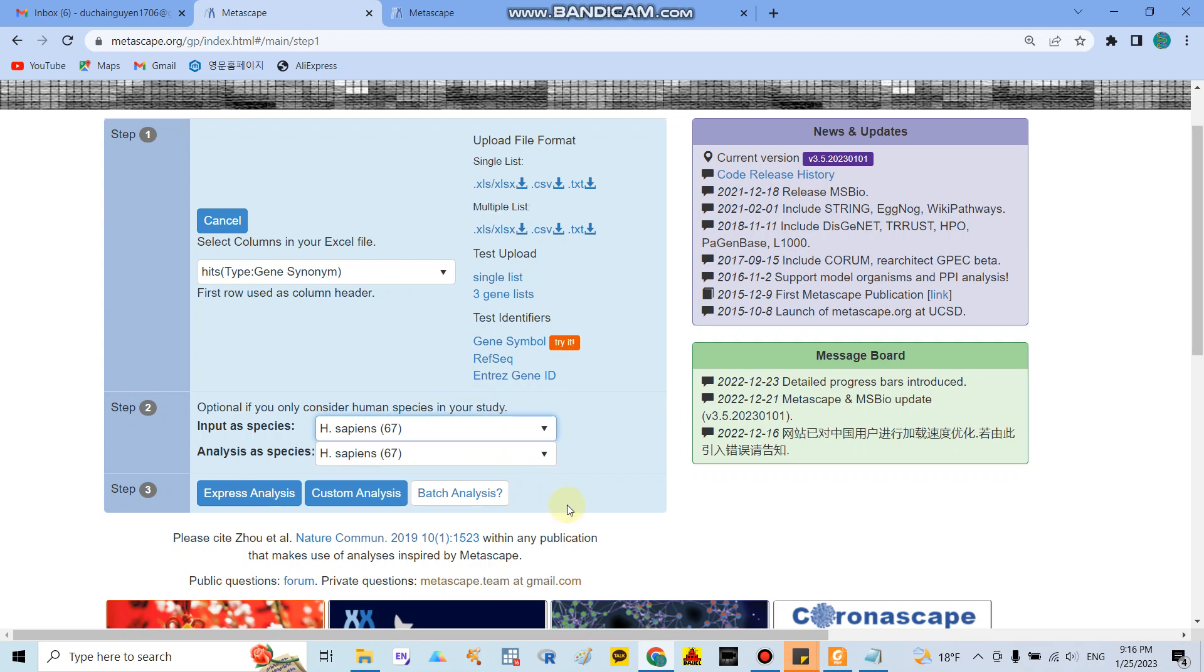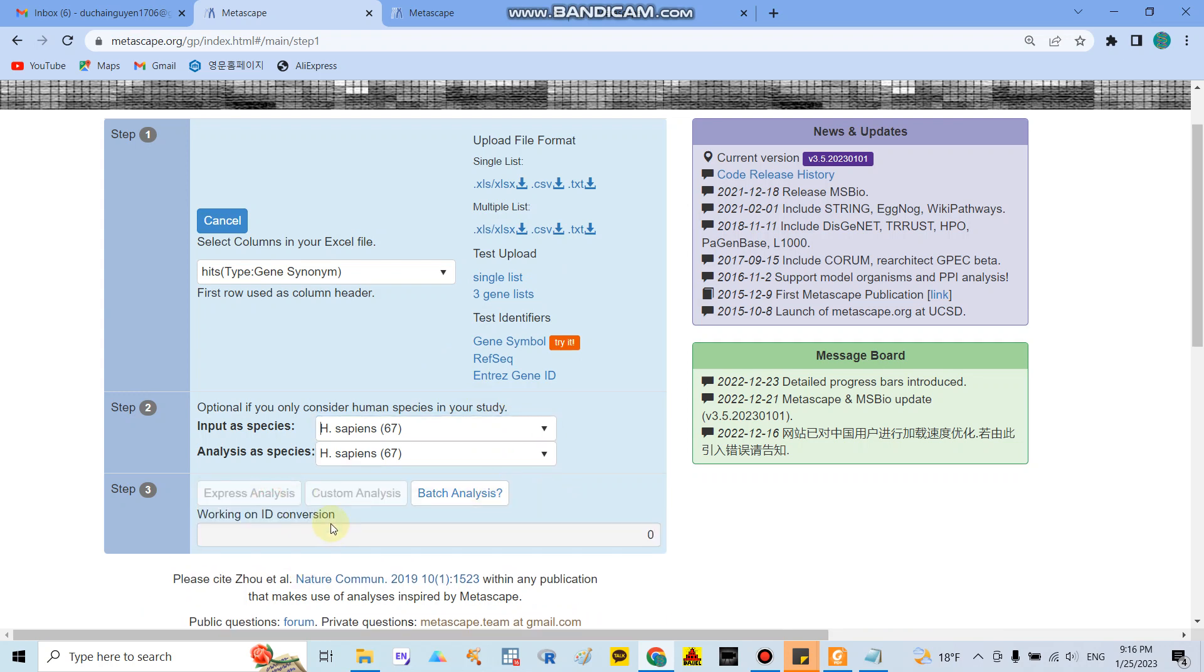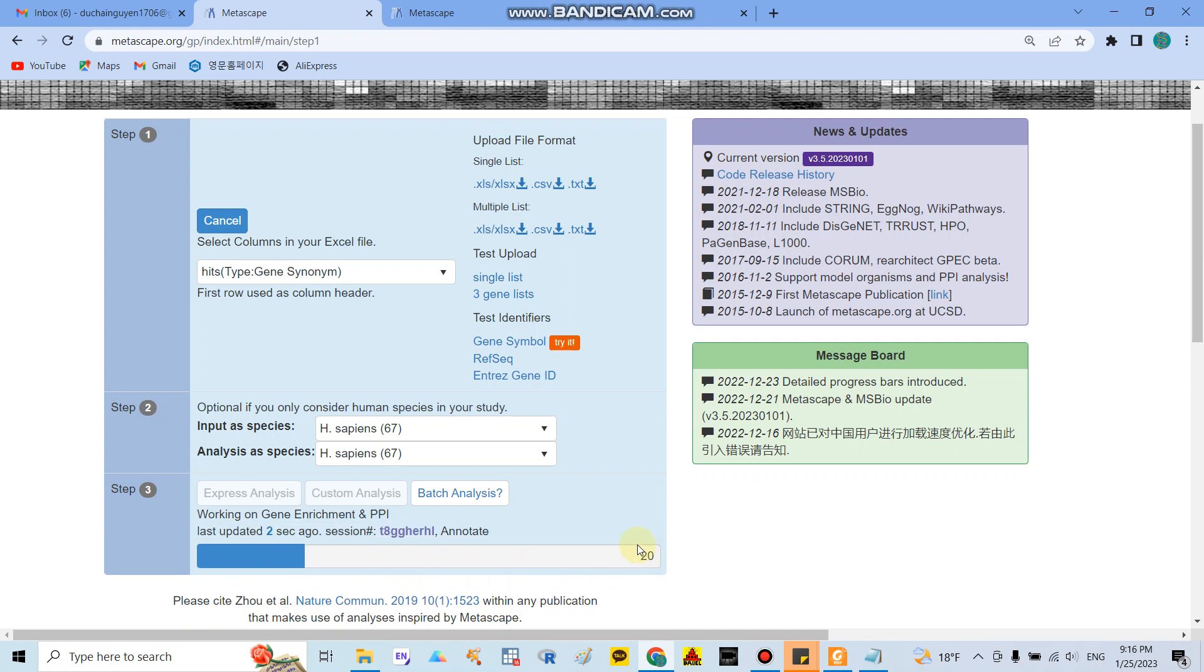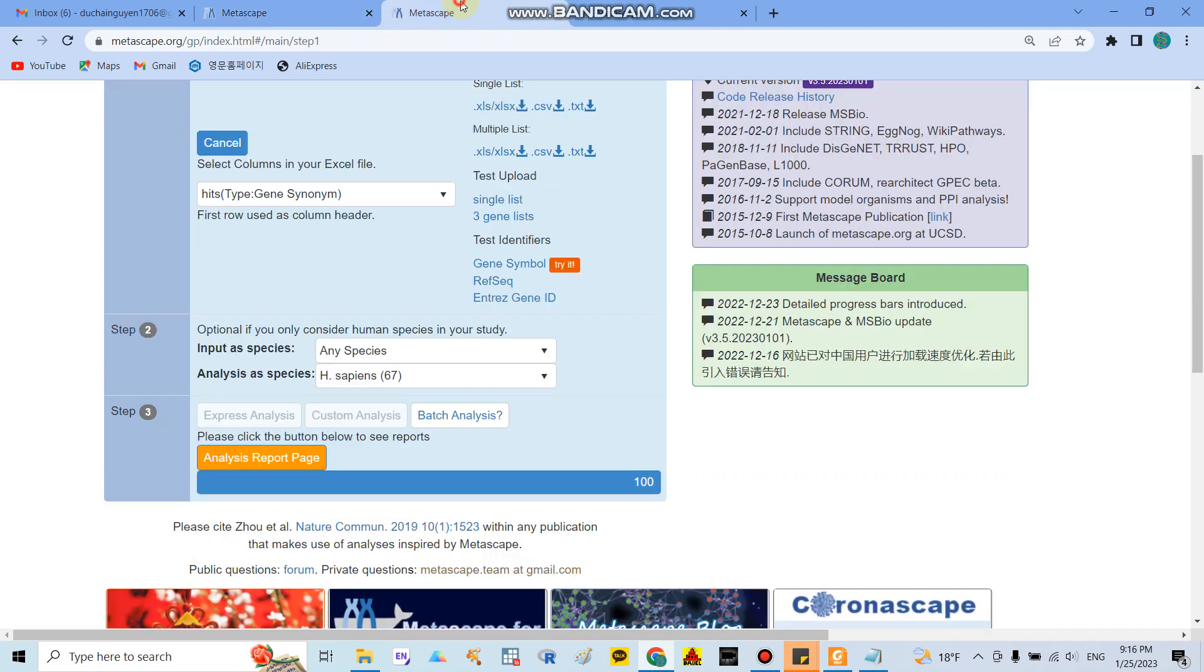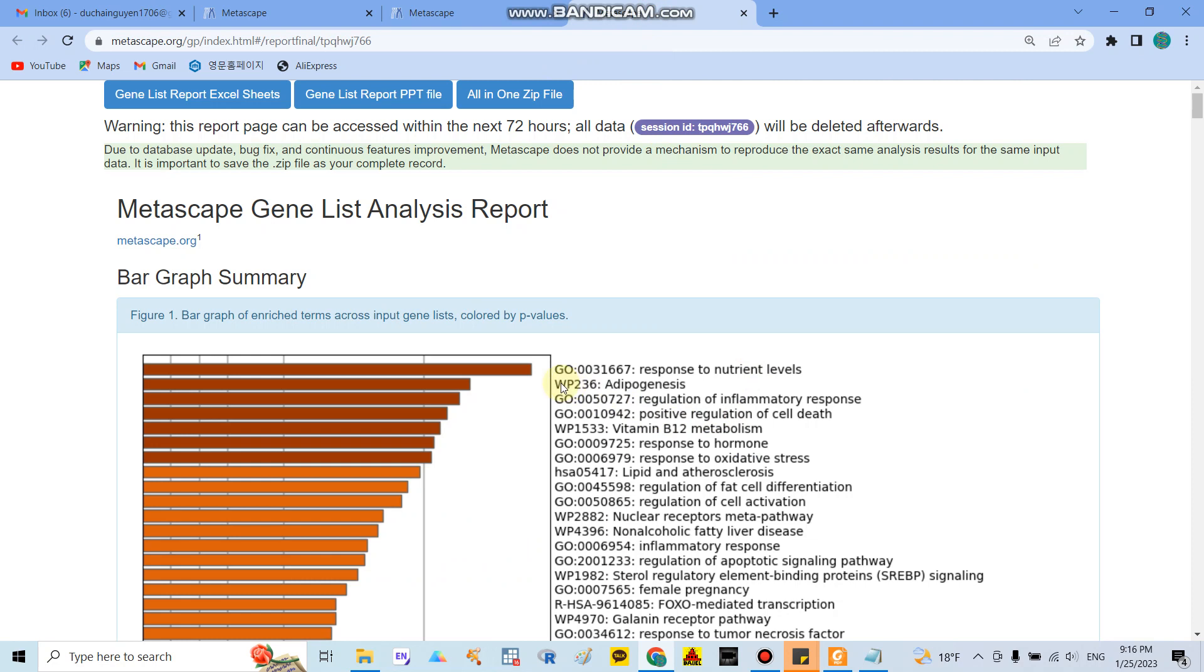So after that I click express analysis. It takes a little bit maybe around two or three minutes. They will align around 20% of total completion. After you finish they will show around 100% completed. So after that you only click the analysis report page and they show you the result like that.